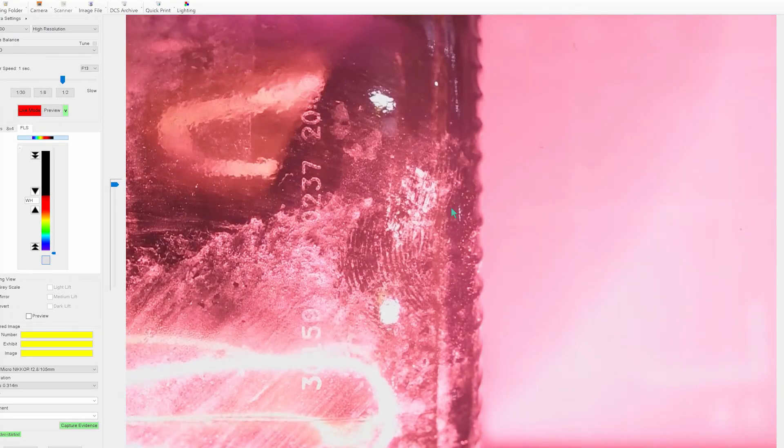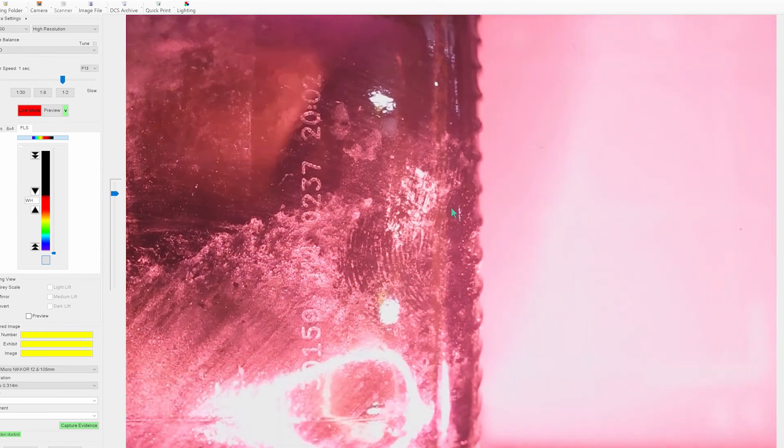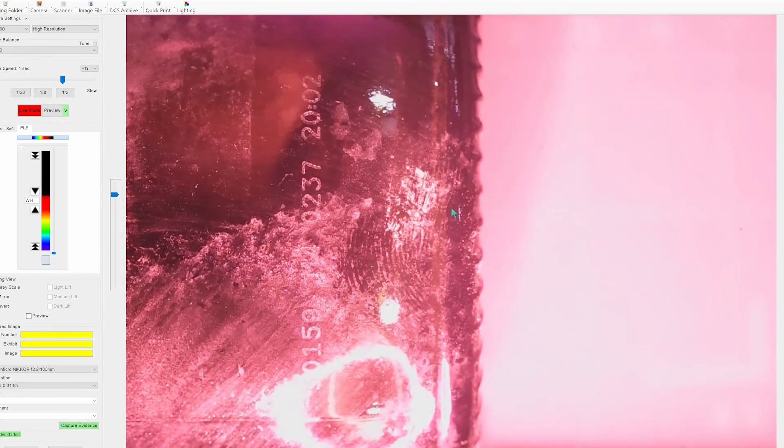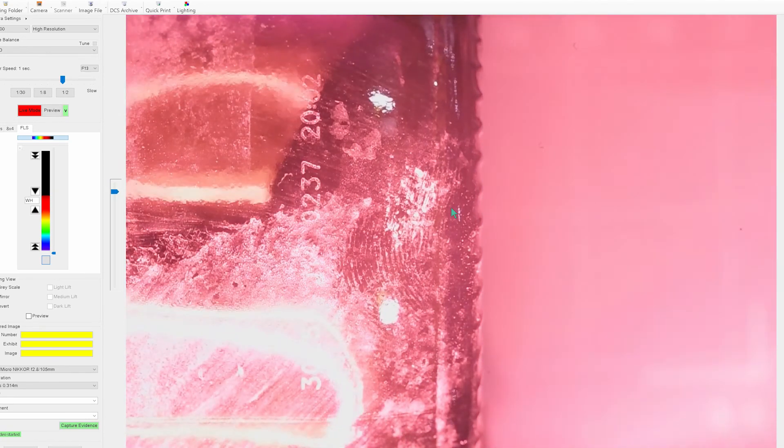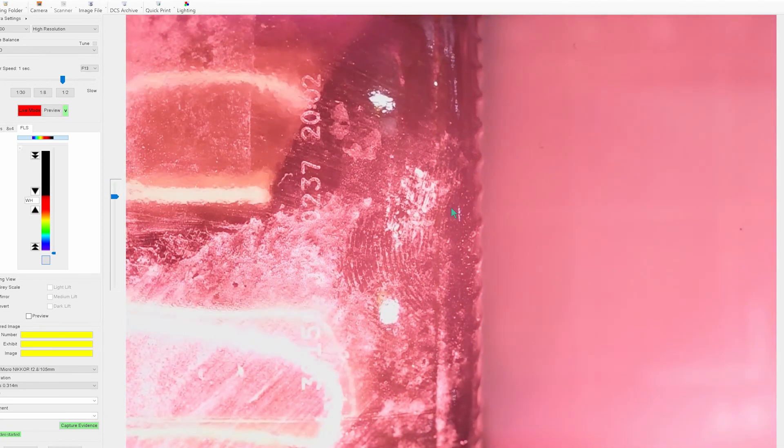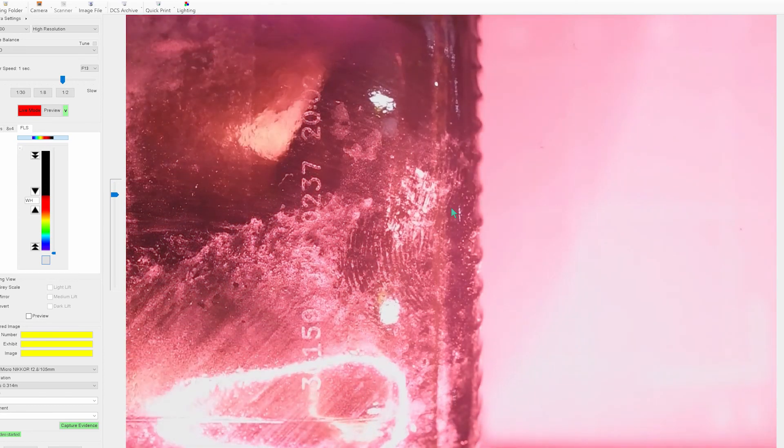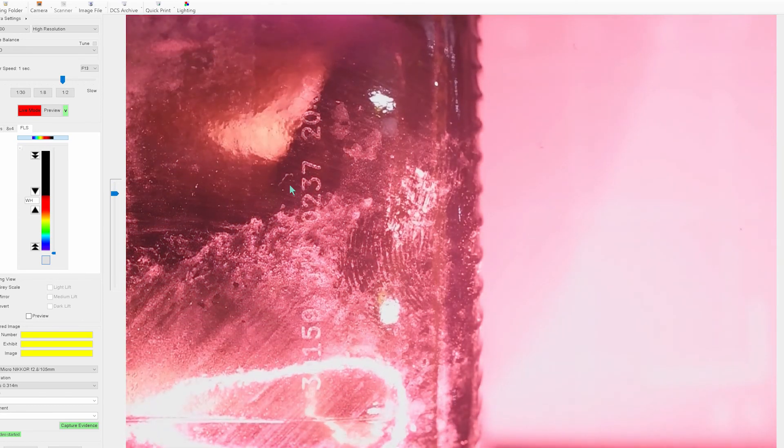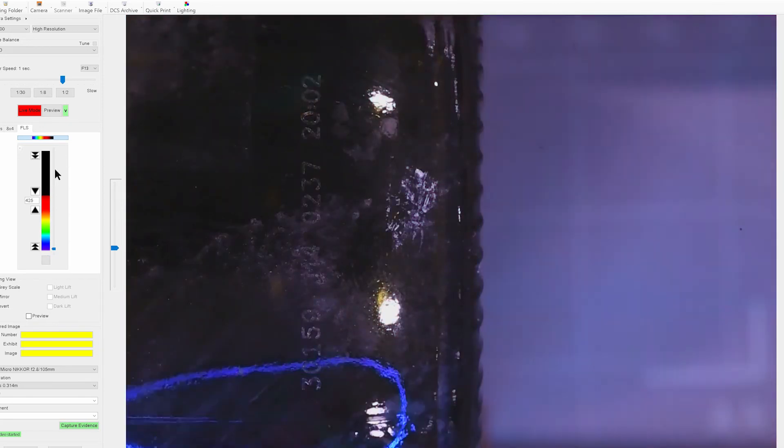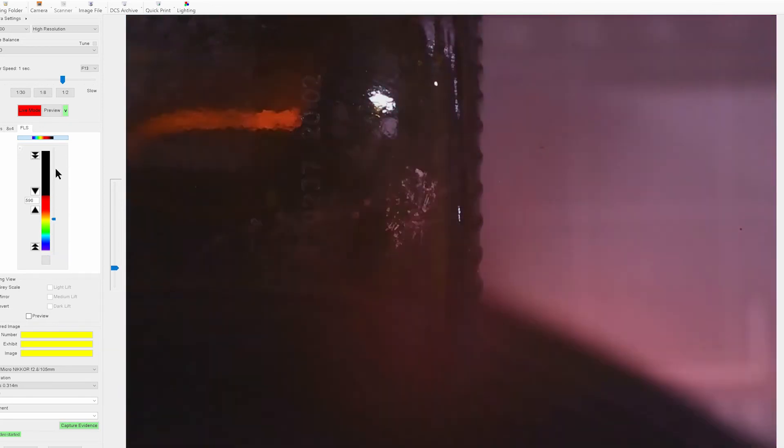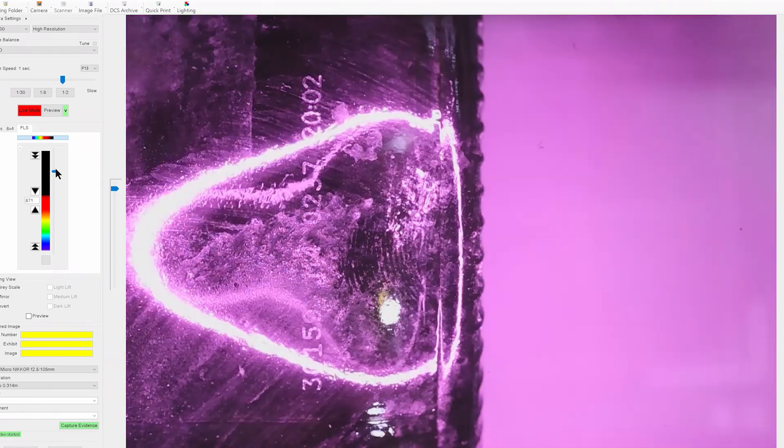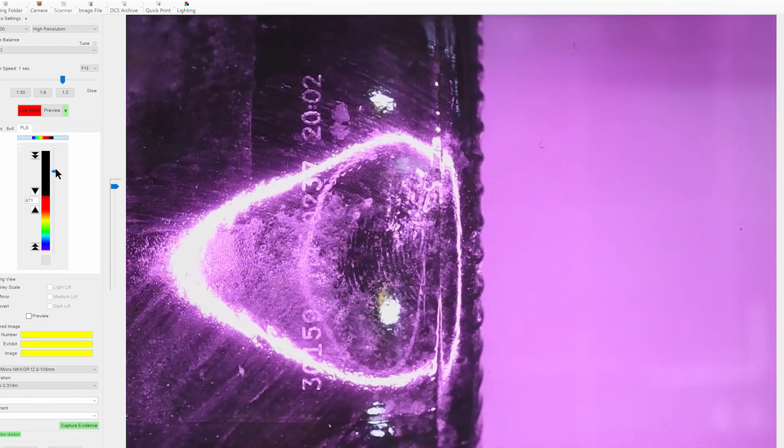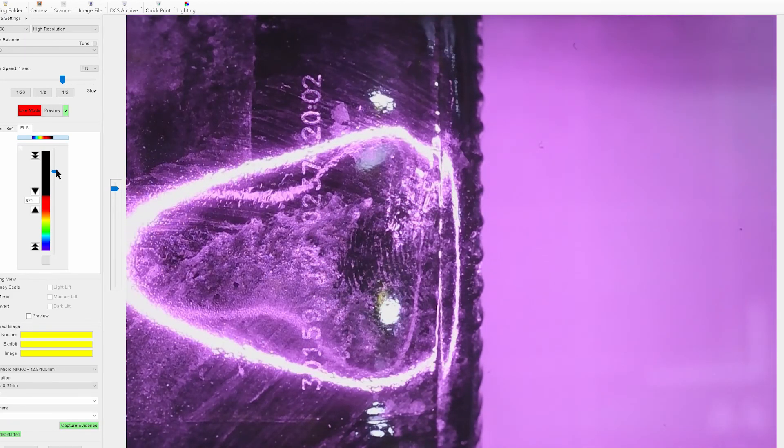This is just in simple white light at the moment but we're going to try and improve this with other non-visible techniques so we're going to move into the near infrared part of the spectrum, adjust the angle of light, and then we have our finger mark.